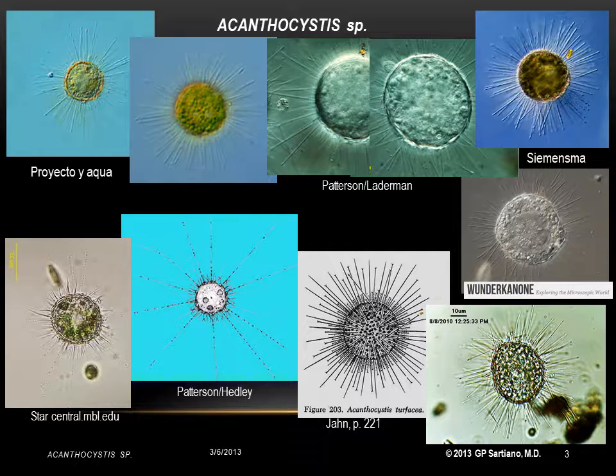As noted previously, there are many photomicrographs and drawings of Acanthocystis to be found in the literature and on the internet.